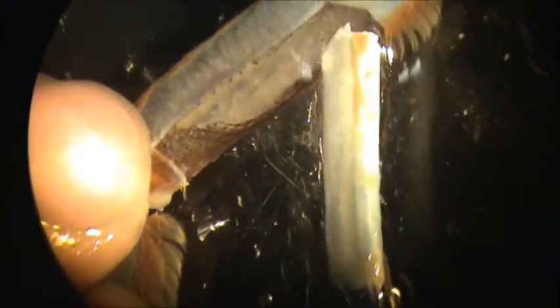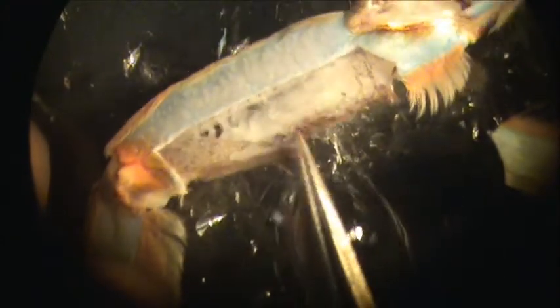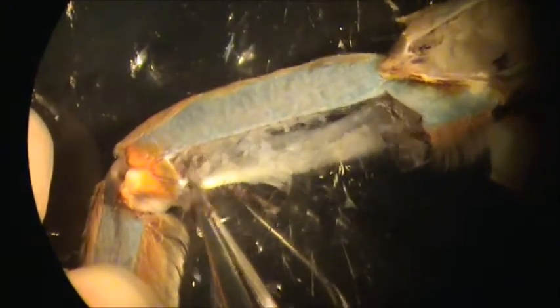Now we should remove the cuticle. Then remove the connective tissues here. Then you can see that this is a tendon with those muscle fibers that are closer muscles. Then we can cut the tendon here and remove it. And the nerve bundle is located in this region here.